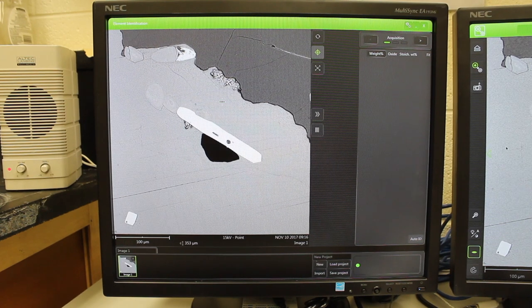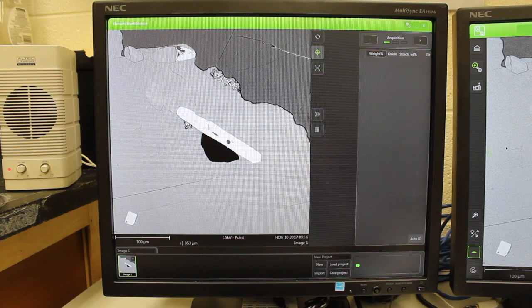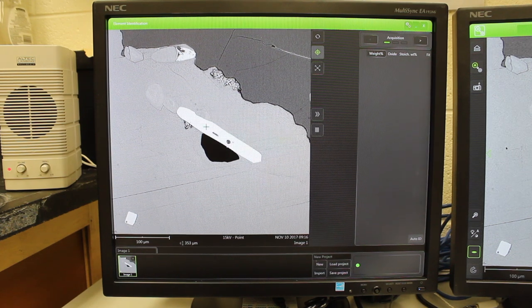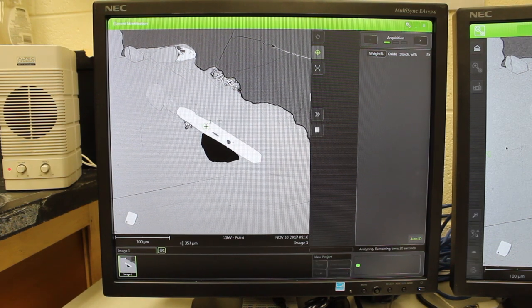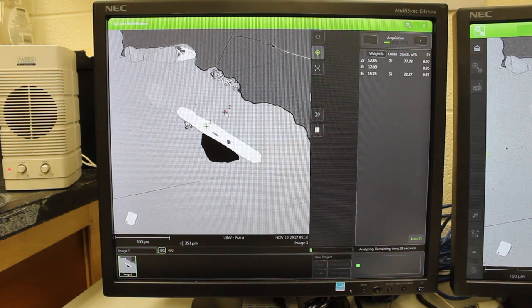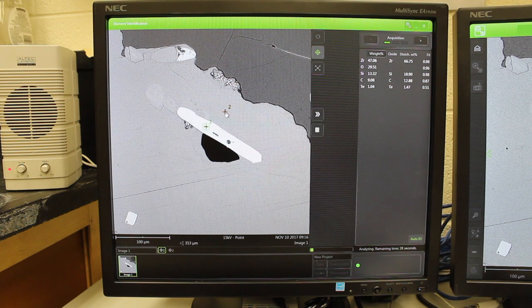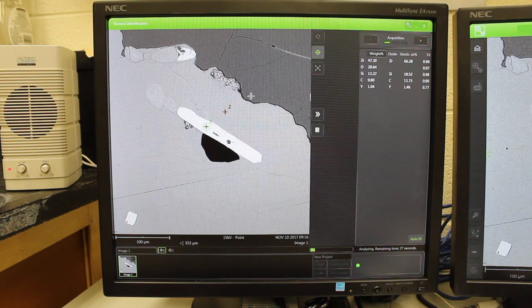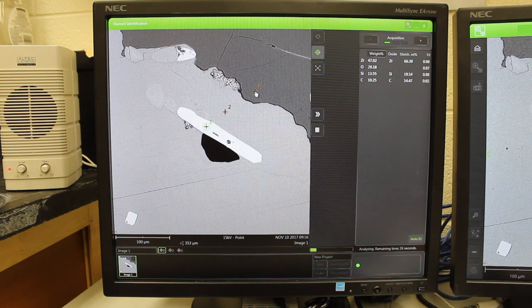To do point analyses, simply click on the different points you want to analyze and the spectrometer will begin to analyze them immediately.